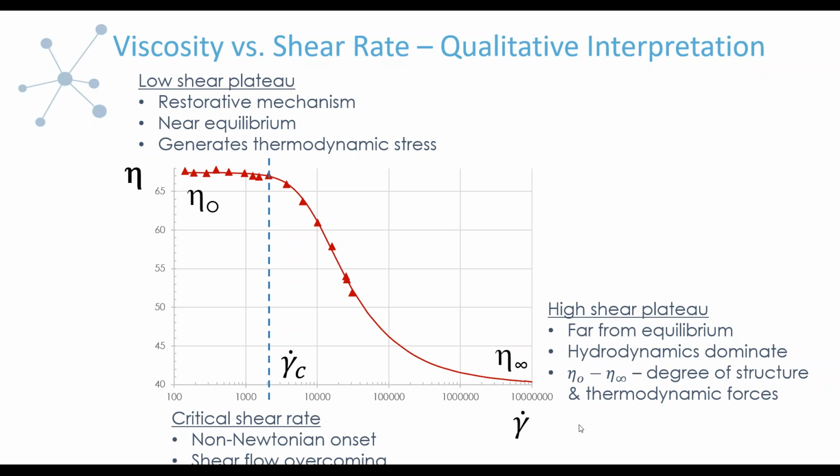Okay, so I understand that sometimes this language is very specific, but hopefully you can think about those ideas and, when you're looking at this type of data, have a different view of it and a deeper understanding. Okay, so now with all of that, from this knowledge of what we've just discussed, how can we use that then to decide how we're going to scale our viscosity axis?